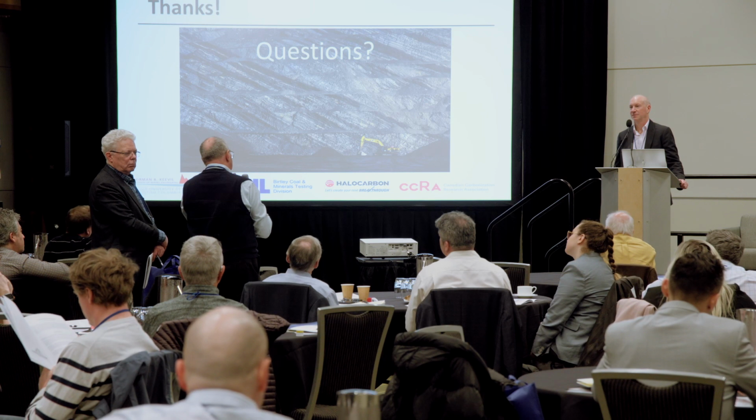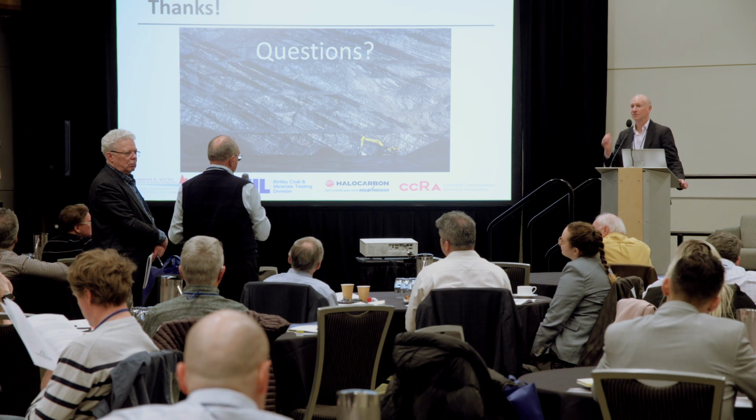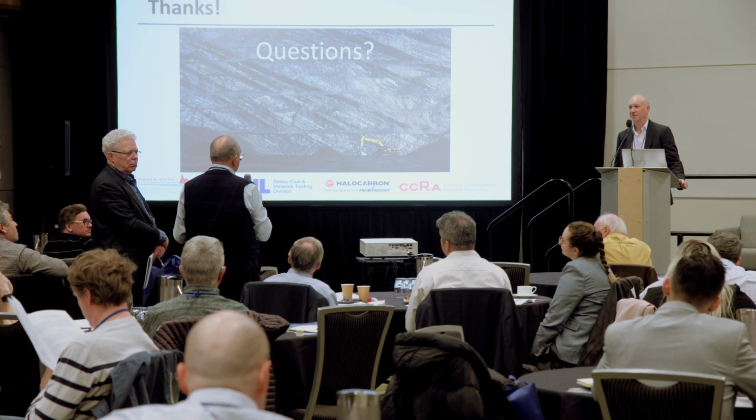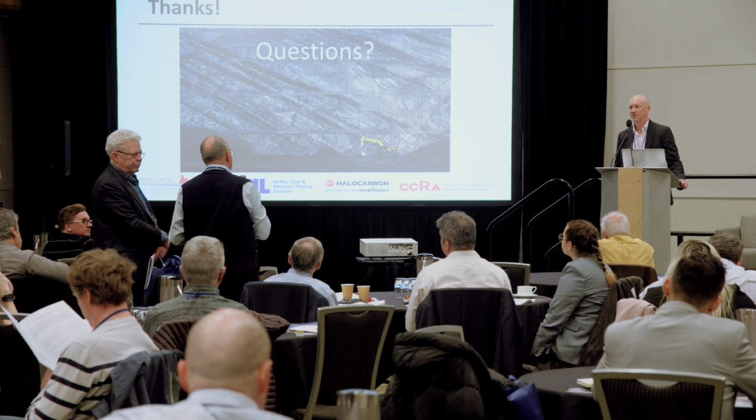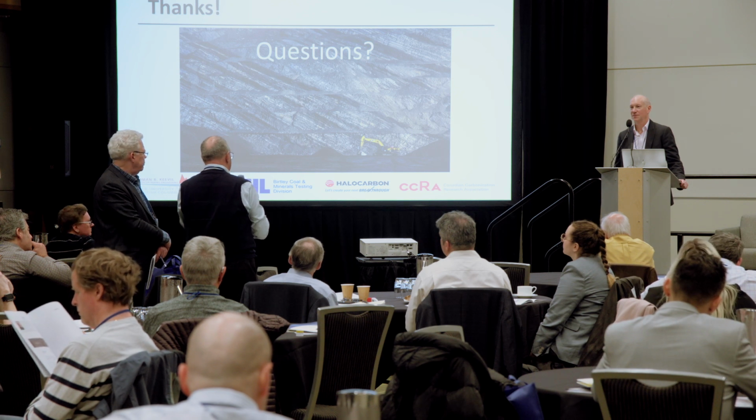And I really would encourage you to do some tests on some lower ranked coals, a lot of thermal type coals, where you've got much higher volatiles, and soft coking coals in the middle that have much higher fluidity properties, just to prove to people that they actually can be confidently tested using this kind of float sink approach. So I really congratulate you. You've brought it this far. Now it becomes a global thing for global standards committees and mining companies that operate outside Canada to really start to look at and adopt.